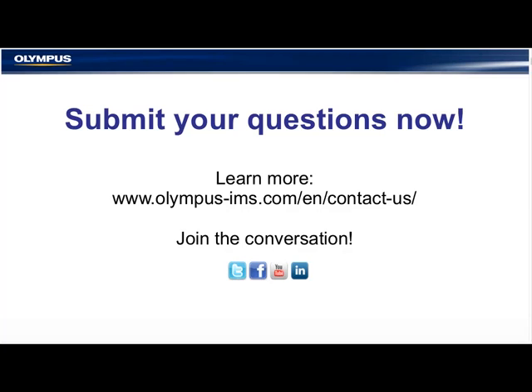Do you sell or provide references to vendors or type standards to check assay quality? That's an excellent question. Yes, we do. There is a company that we use out of Colorado that sells round-robin certified check standards, and we've used them quite often.